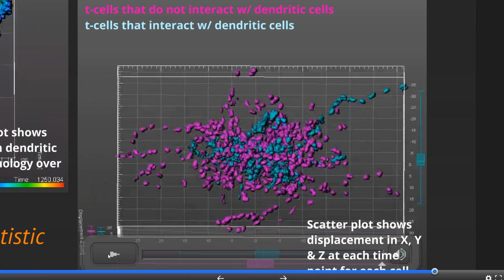Currently, Imaris does not batch process image processing functions. So smoothing, background subtraction, attenuation correction, those cannot currently be batched. However, creating the models, the surfaces, the spots, the filaments, the cells, all of that can be batch processed, not the image processing component. The batch module is basically designed for you to put a bunch of data into a particular group, and then you can apply the same parameters to that group. Image processing functions will be available in Imaris 9.3, which is coming out in the fall. So that means you can combine those image processing functions that are currently available in Imaris with those creation parameter routines.